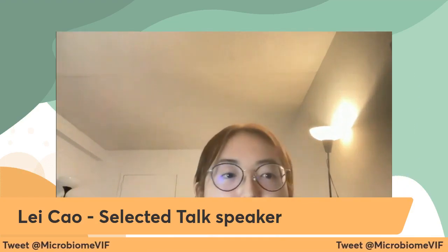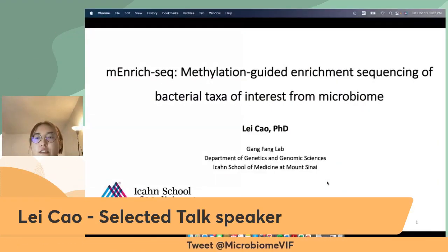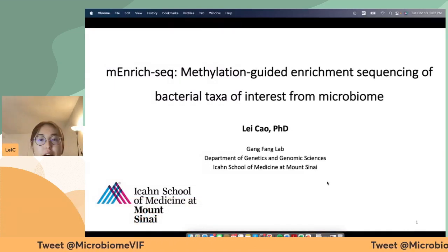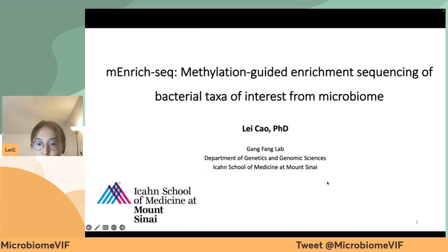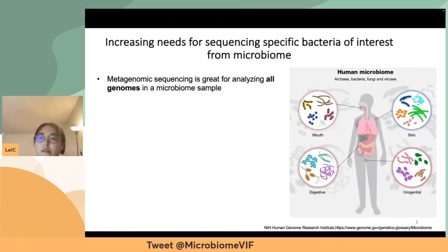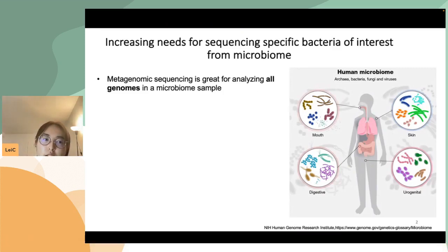I'm very happy to present our latest work, mEnrich-seq: methylation-guided enrichment sequencing of bacteria taxa of interest for microbiome. So some background to start with. Our human body is a very rich resource for all kinds of microbiome, and metagenomic sequencing is a great tool for profiling all the genomes in one given sample.